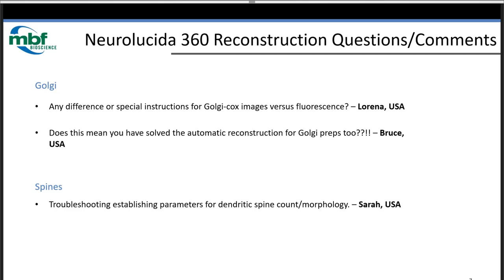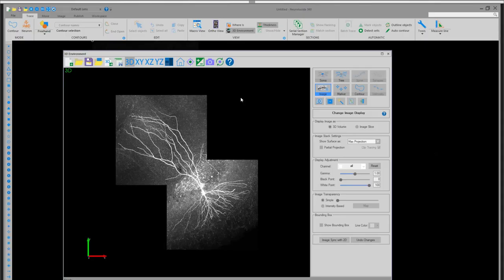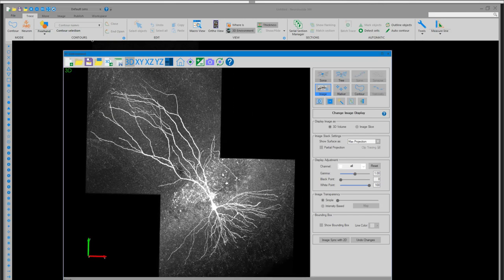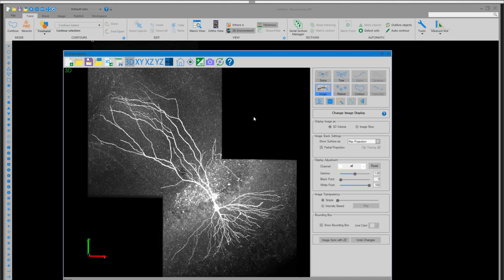Right now we have an instance of Neurolucida 360 open with a pretty intense staining on this image. This cell is a cortical neuron that had been recorded from using electrophysiology techniques. After the conclusion of the ephys experiment, they injected dextran into the cell so you could identify the morphology. This allows you to do structure-function modeling by relating physiological responses to the morphometric features of the cell.